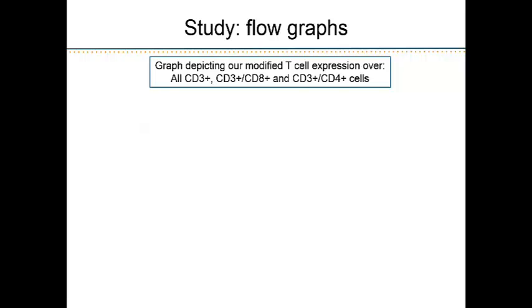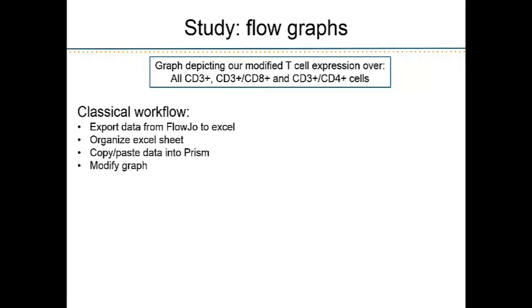So I'm just going to give you an example of how I would create a flow graph in real life and how I would create it in LabKey. So if I'm interested in looking at our modified T cells in CD3, CD4, and CD8.